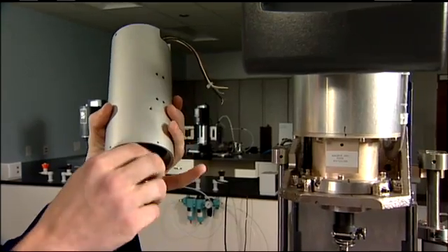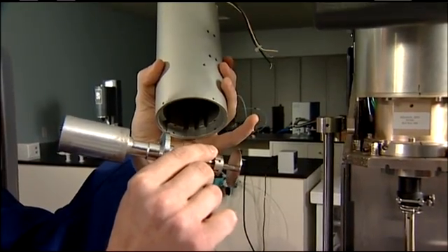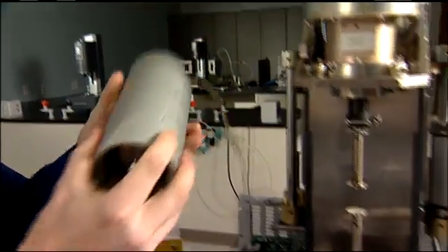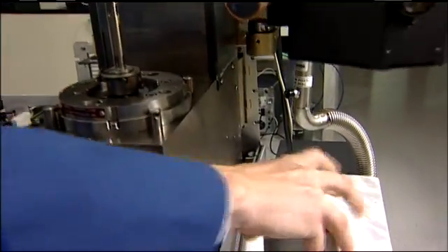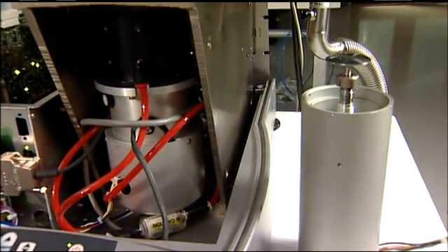Any single motor design, synchronous or asynchronous, has to apply some amount of torque to overcome the inertia and friction of its moving parts. The same motor applies torque to the sample. The unavoidable consequences are constant corrections for friction and inertia, and uncertainty in your data when corrections far exceed sample torque.